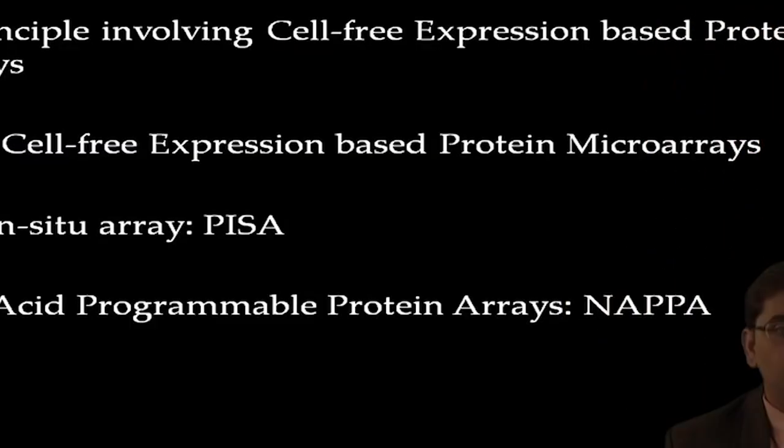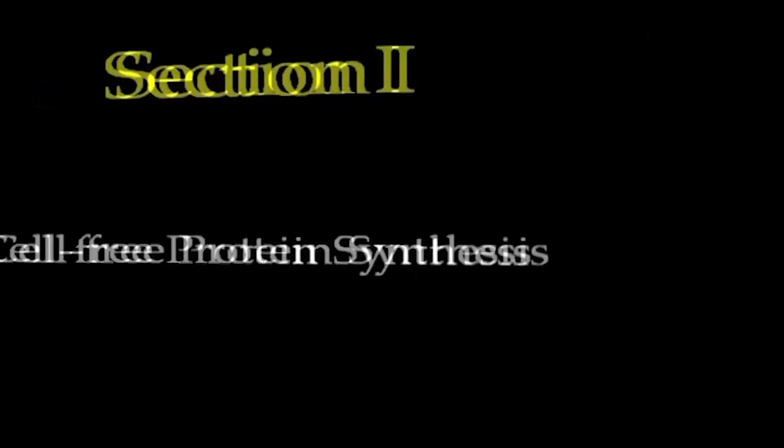Today, we will mainly focus on two widely used cell-free expression based microarrays, namely protein in situ arrays, PISA, and nucleic acid programmable protein arrays, NAPPA. In the next lecture, we will expand our discussion to other techniques. We will discuss the principle of each one of these platforms, their advantages and disadvantages.